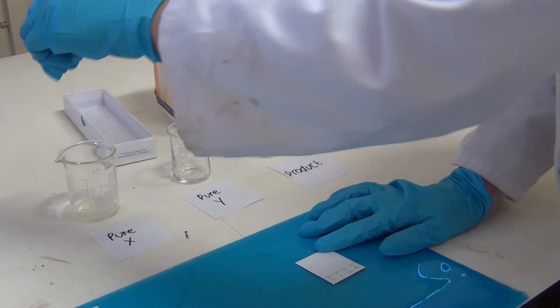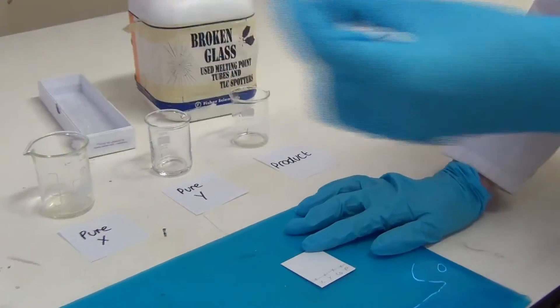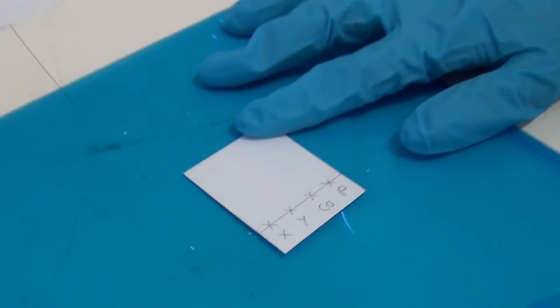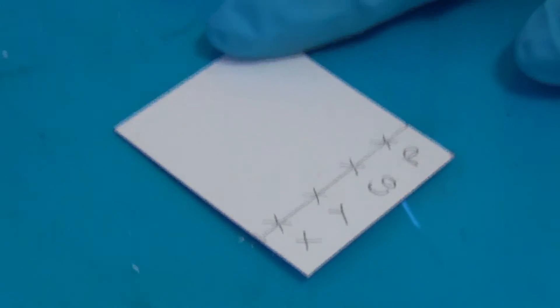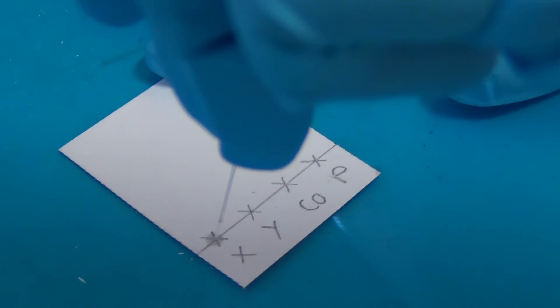Then use a capillary tube to spot a sample of compound X onto the mark labelled X on the TLC plate. Make sure there is enough sample spotted on the TLC plate, so make sure to spot two to three times. Also spot on the mark labelled Co.